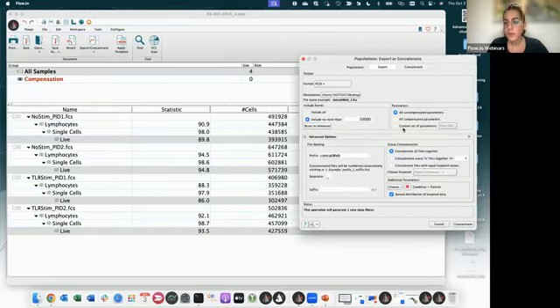Now, I got also this question in the mailbox. In the concatenation dialog, there is a checkbox that says spread distribution of keyword data. What does that do, and when should I leave it on or off? If you hover over, you see that it gives you an explanation of what it does: it adds some random noise to the value of keywords so that they form clusters around the actual value. Well, you don't want to have that. You want to have the actual value without any random noise next to it. So you don't need to spread the distribution of keyword data.